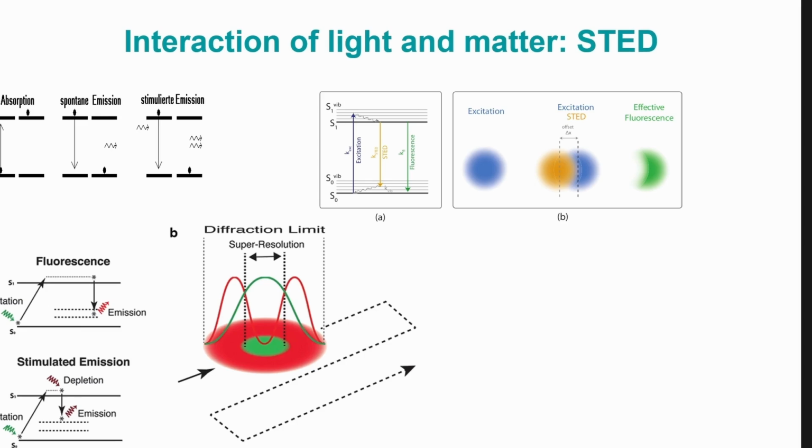And for that we use two lasers. One at a much higher wavelength, basically an orange colored laser, which forms not a spot but a donut. The middle of that is the torus. This is a high energy laser, and I align that very precisely with the laser that I would use anyway for my fluorescence excitation. So I combine two lasers. Technically, this is of course not easy because any misalignment will ruin the effect.